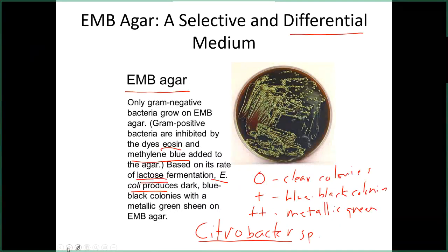The reason that gram-negatives, as I said, are significant is that many of them are pathogens, and there are also a number of them that are found in fecal material. So if they are present, say, in a lake, a place like Beach Lake, and people are going there swimming, and somebody samples the water and finds gram-negative organisms in there, especially those that can ferment lactose really strongly on this agar, then you probably have some fecal contamination.